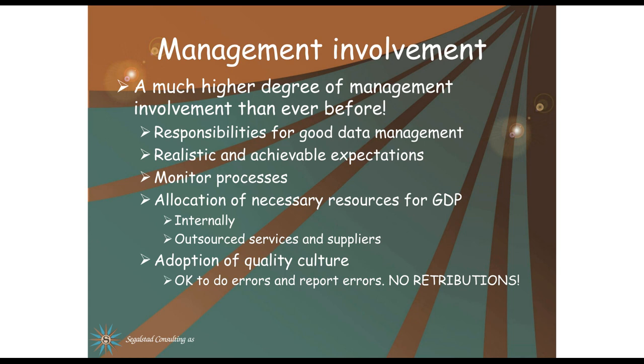Requirements for data integrity is that management shall be involved, and that means a lot more work for them than they had before. They are responsible for good data management. They have to create realistic and achievable expectations, monitor processes. They need allocation of necessary resources for this good documentation practice, both internally and for the outsourced services and suppliers. The adoption of the quality culture, which means it is okay to do errors and to report errors, but no retributions.